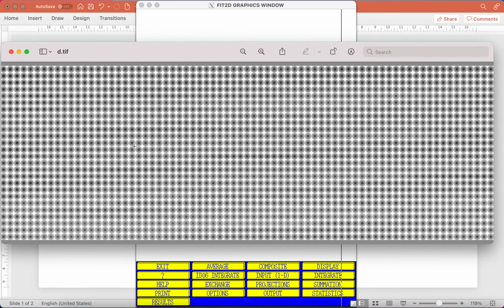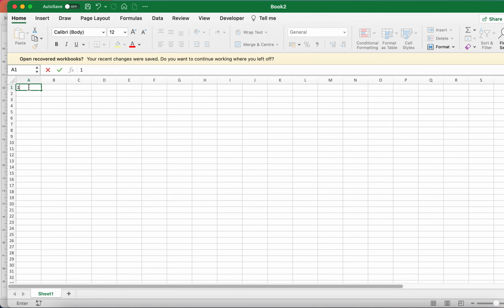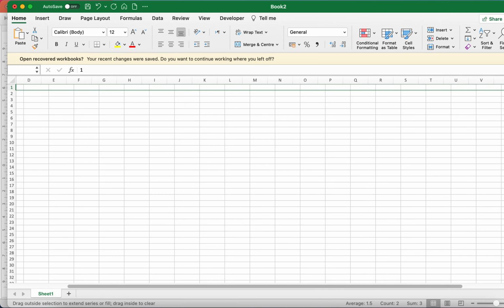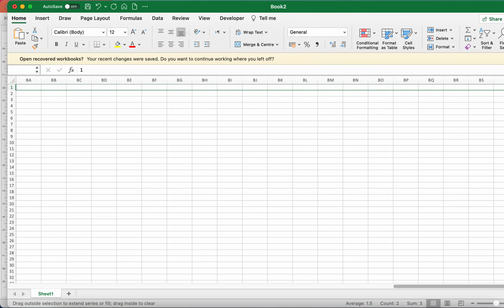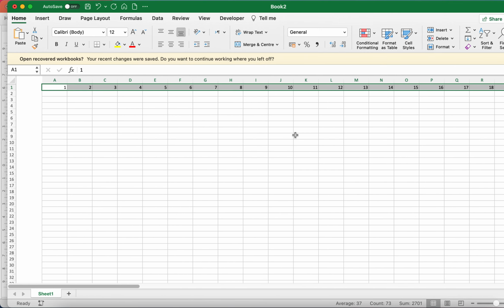this area in numbers. So what I mean is we select the first cell here, we input 1 and then 2, and then we drag it. So it has to be 1 and 2, then drag it to 73, because we have 73 columns. So this is our 73 columns.